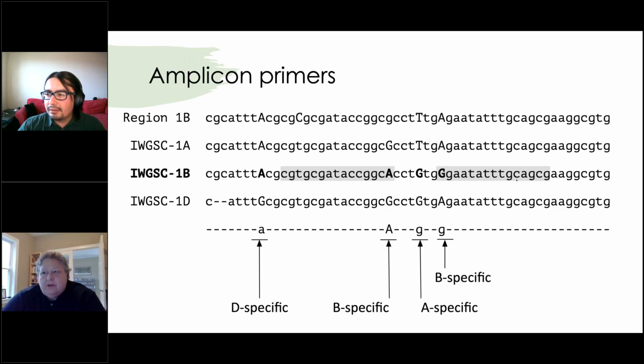So what does the input look like for a deletion? The input that we use for the deletion is the sequence of the region that you want to design markers for, and if you want to let the program know which is your marker, instead of having regular names, the name of the sequence should correspond to the output of SAMTools FAIDX, which gives you the chromosome name and the region that you're amplifying. So PolyMarker uses that information to know where it needs to match.